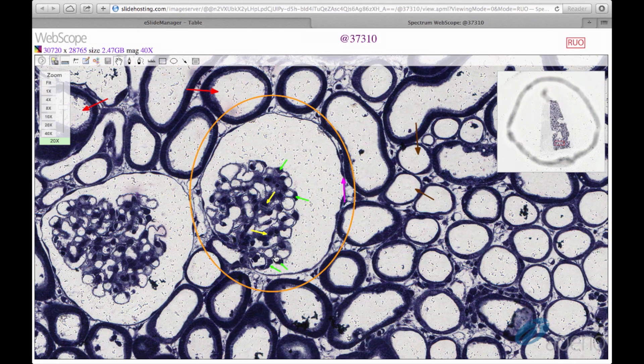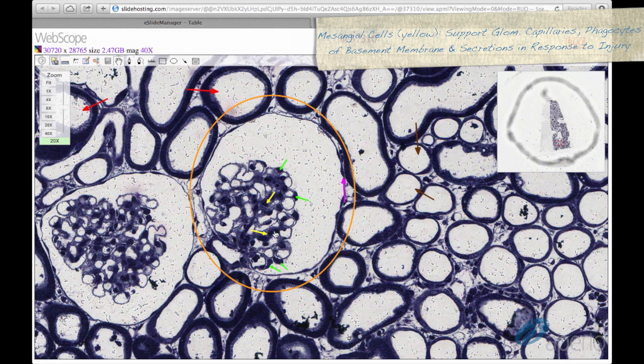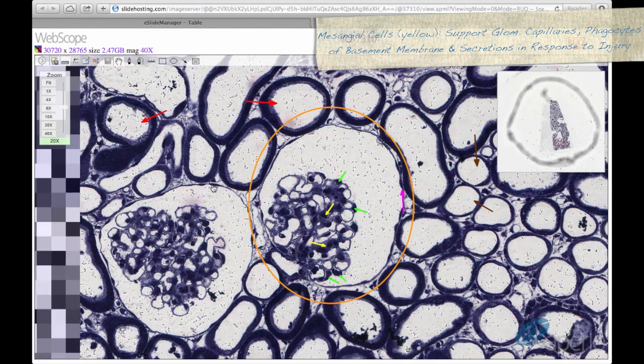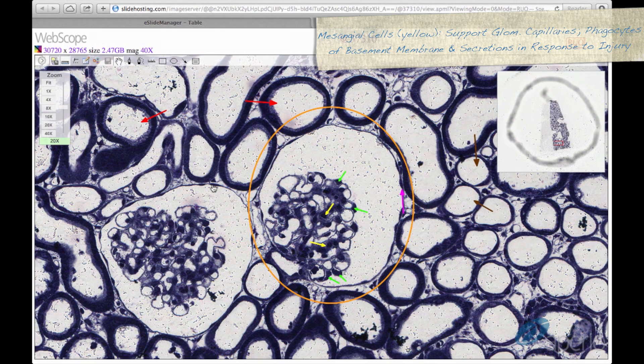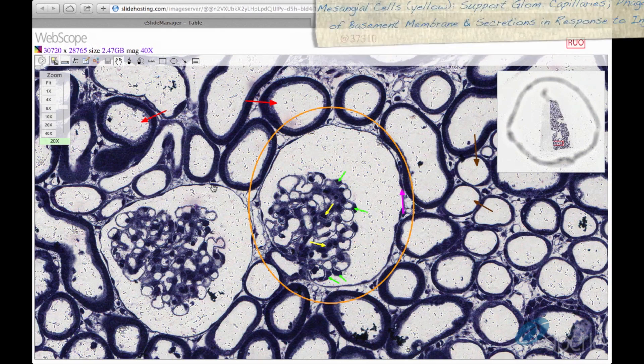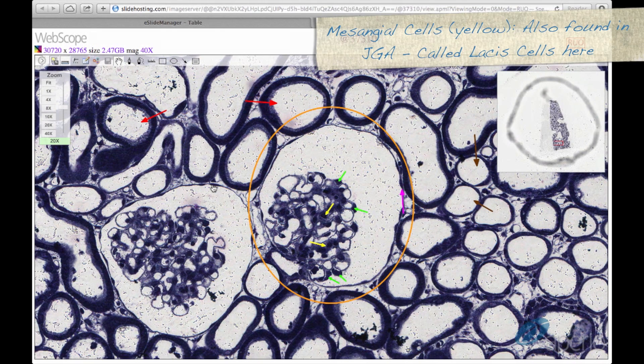We can also see mesangial cells, here at the yellow arrows. Mesangial cells are the supporting cells of the glomerulus. They function to support the glomerular capillaries, act as phagocytic cells to keep the glomerular basement membrane clean, and secrete molecules in response to injury. Mesangial cells can also be found in the juxtaglomerular apparatus, where they are known as lacis cells.